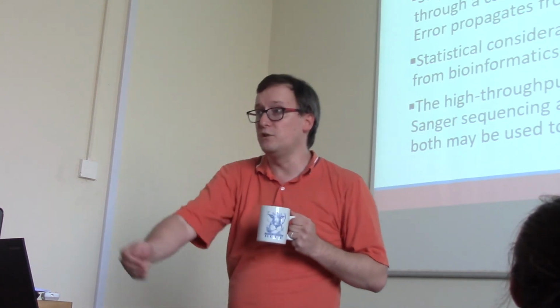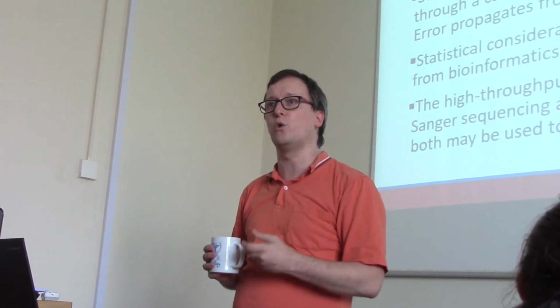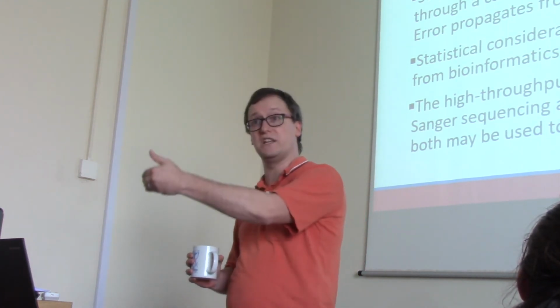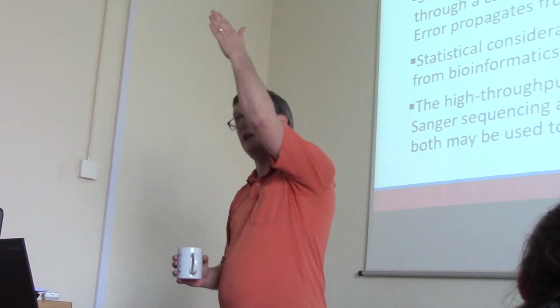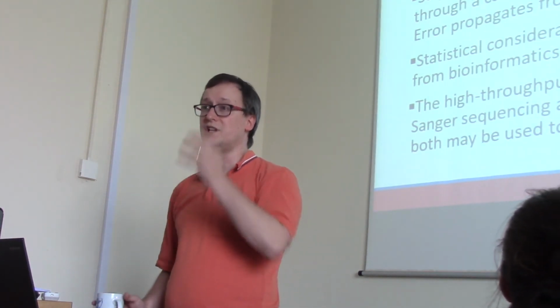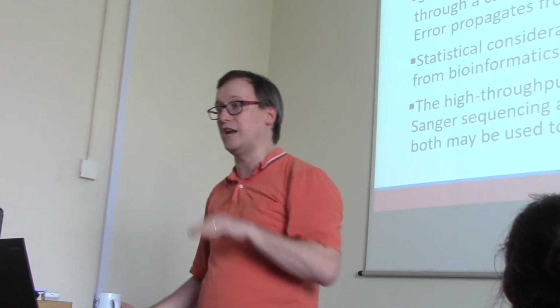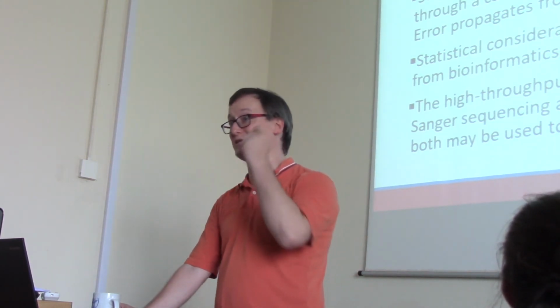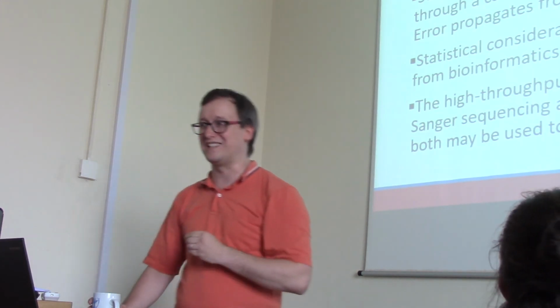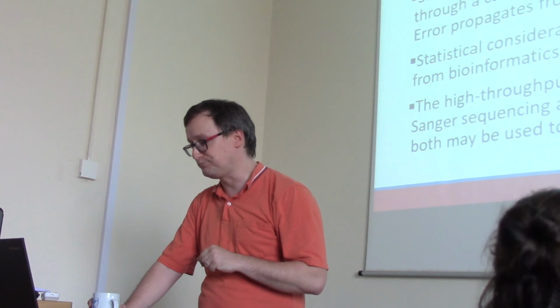If I fail to use Trimmomatic correctly to strip off sequences that are of very low quality, I may have compromised my alignment. Anytime you're using a very long, very complex series of tools to understand your data, you have a problem of cascading error. So it's best to make sure you get those first steps at least very, very right, because each of them can contribute error to your analysis downstream.